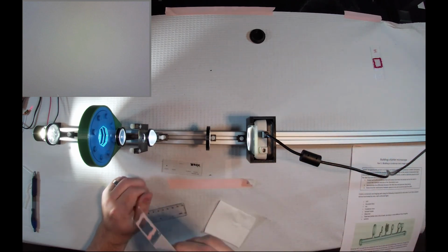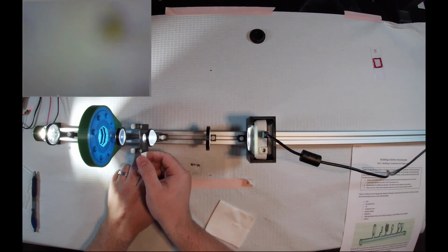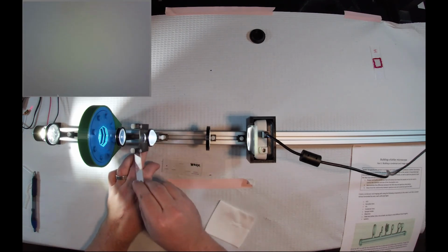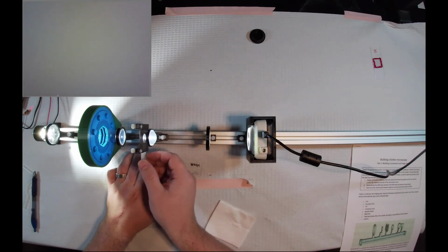I also went by the pond near my house and I collected a little bit of water, sealed it up. Let's see if we can see anything interesting in there. So we've got to make sure we get this aligned. Oh, I always put this in the wrong way. You want to make sure that your cover glass, which is the thinner part of your sample mounting, is closer to your objective. That will minimize the aberrations in your sample. All right, so see if we can visualize anything in here.